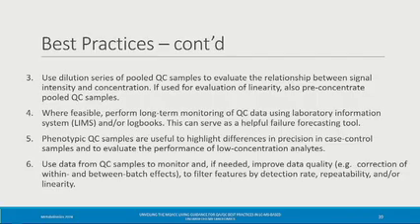Because, right, if you only do dilution series, then you are looking at how your signal changes below the pooled QC levels, right? But you don't have any sense of what's happening if the signal is above, right? So the idea of the pre-concentration is to look both below the pooled QC signal and above. So he has a nice paper where pre-concentration worked and they could look at signal linearity.